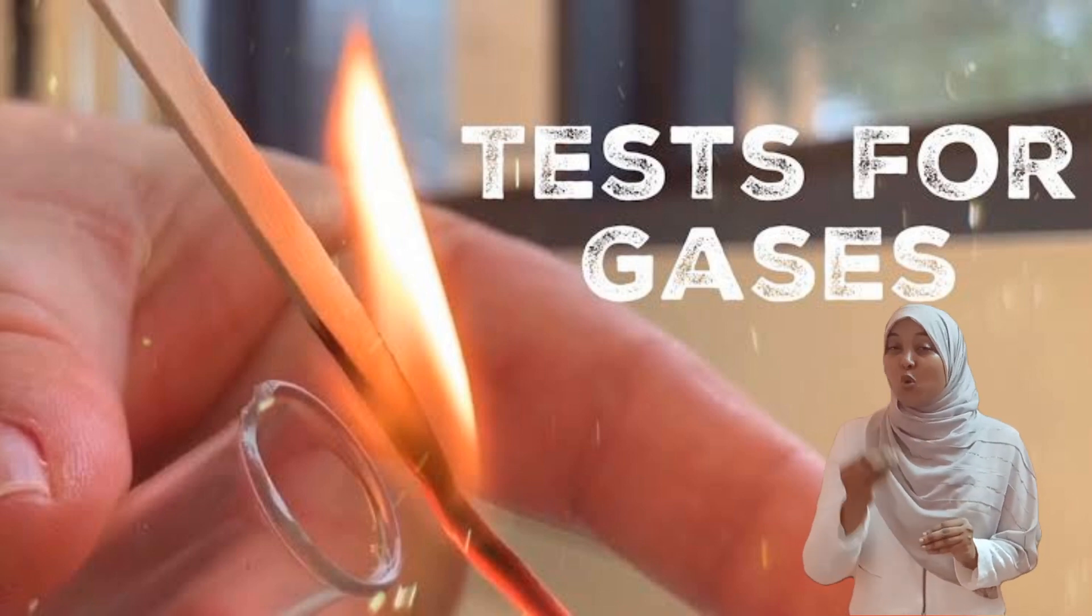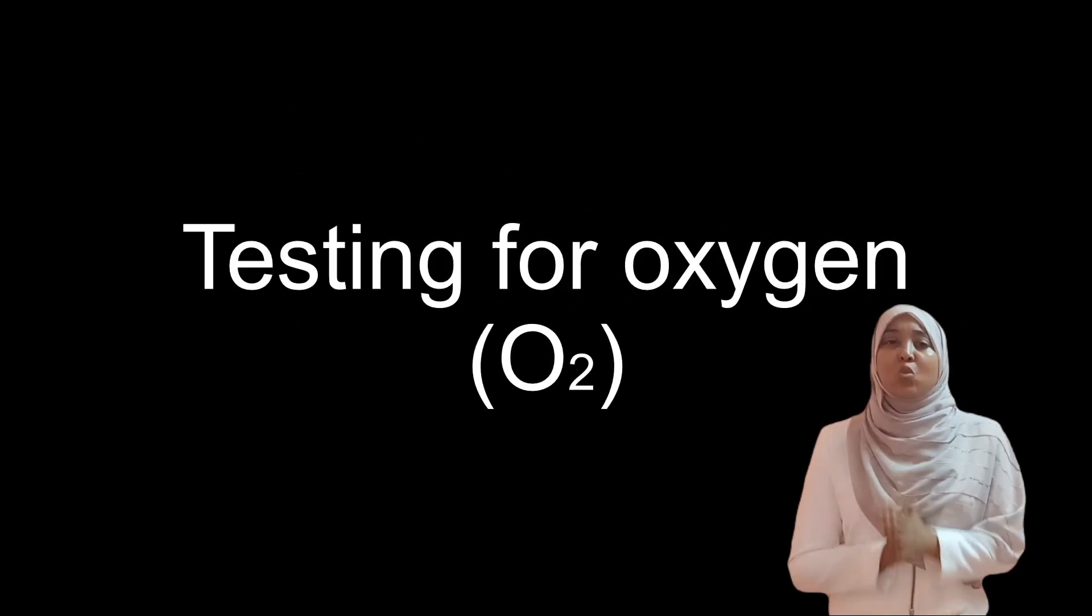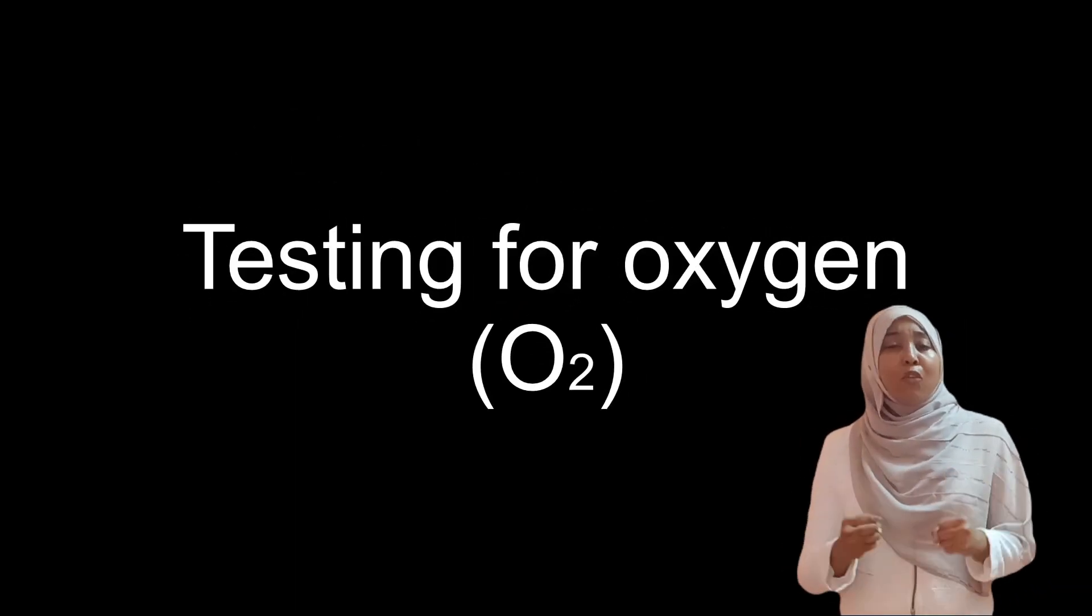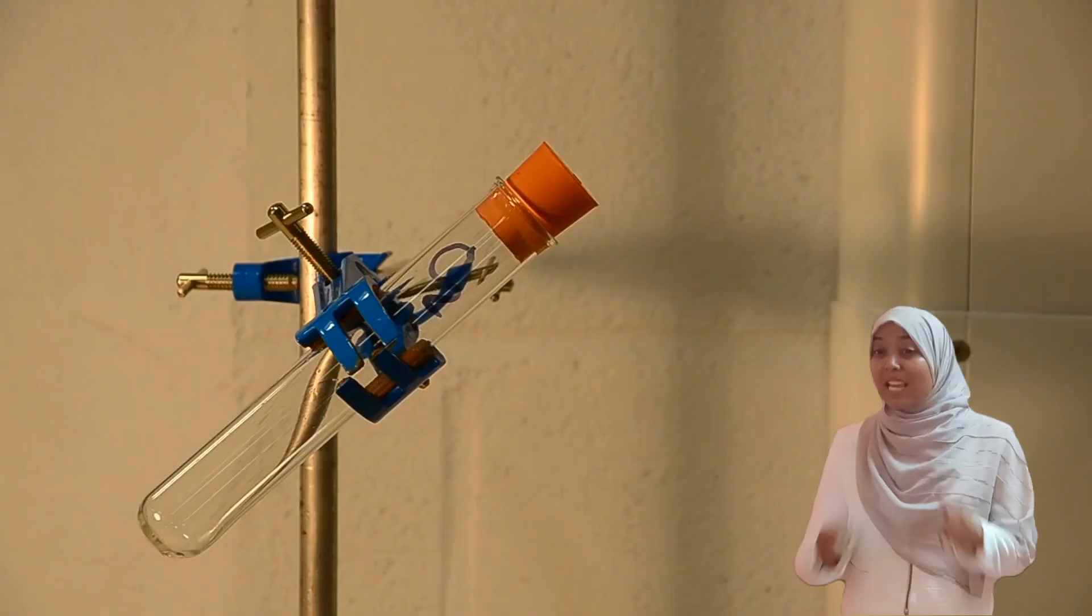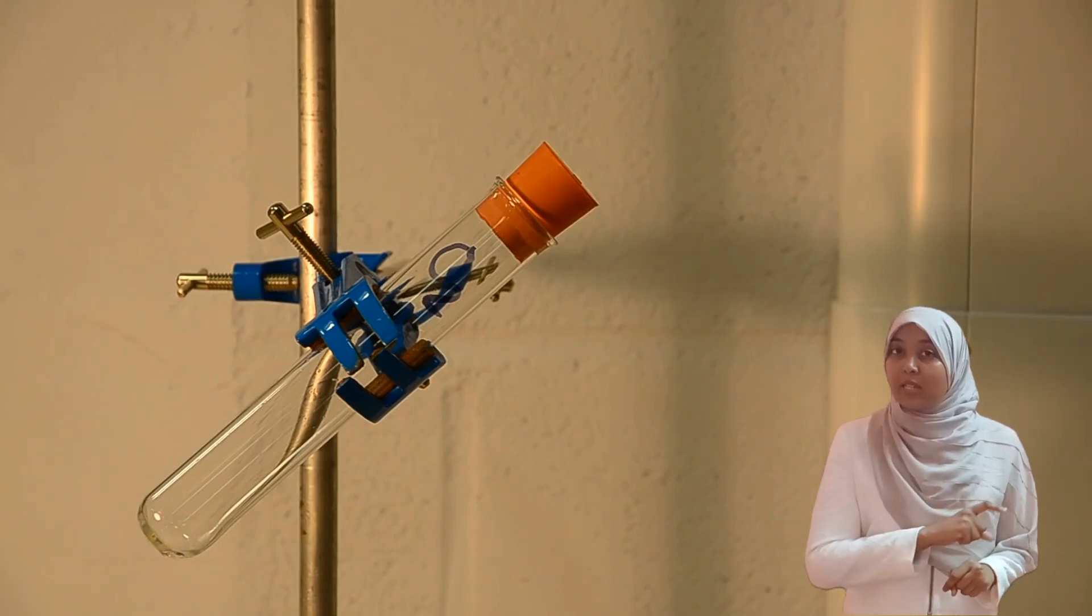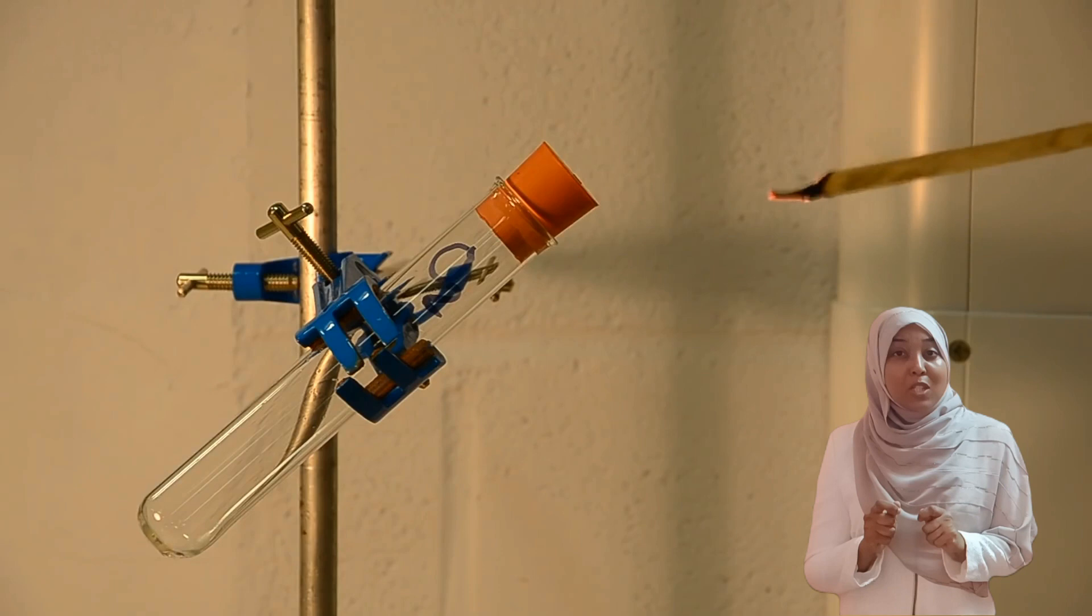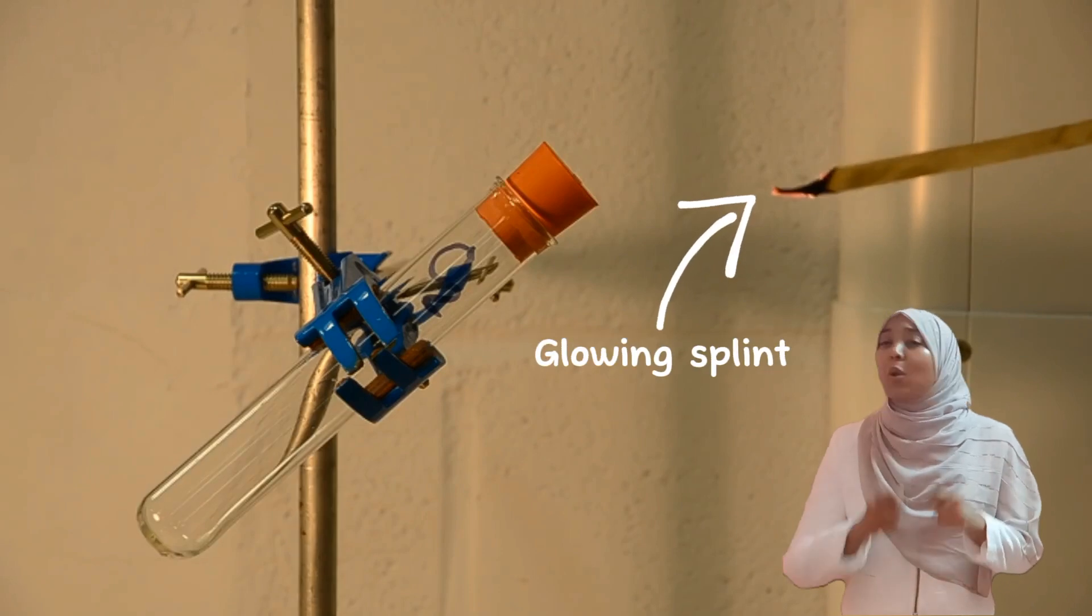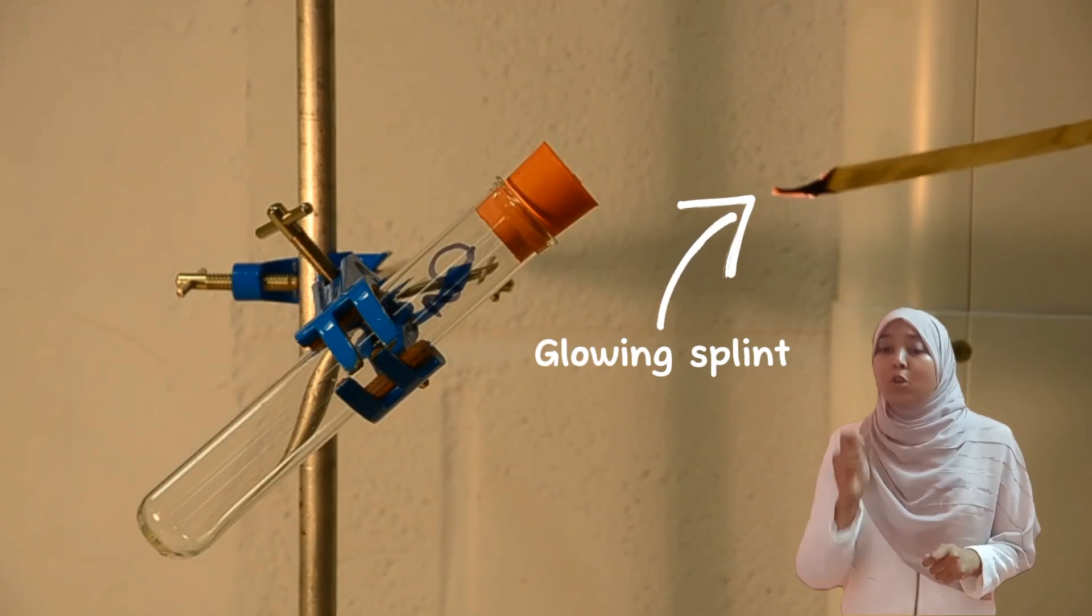Now let's start with the first one: oxygen gas. If you want to test whether a certain gas is oxygen or not, simply use a glowing splint. What is a glowing splint, you ask? A glowing splint is simply when you take a wooden splint, light it on fire, put out the flame—it glows, right? That is a glowing splint.